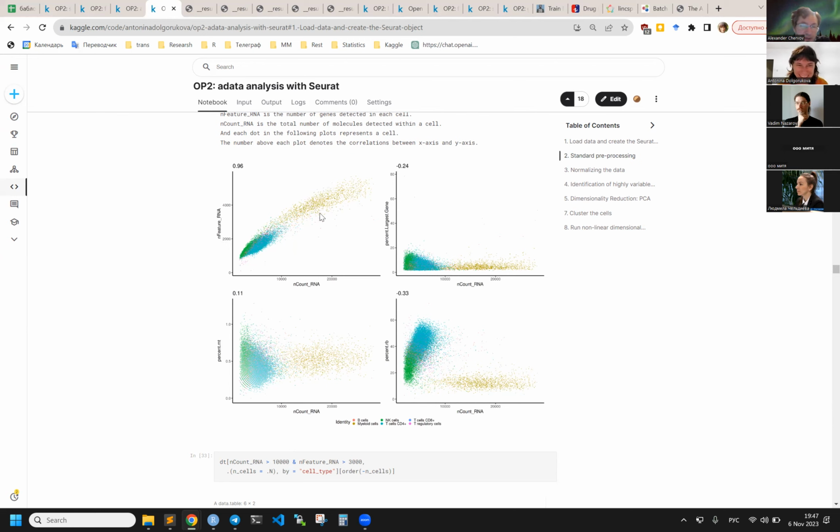So if the cells are under the drugs, they probably have a kind of, I don't know, it's bad for them. They are not in good condition, and so we see fewer counts, fewer of everything, more mitochondria. No, there are different controls: two positive controls, which have to influence expression somehow, and one negative control. The positive controls are drugs with a very strong effect, so that should be the opposite. This strong effect should almost kill the cells.